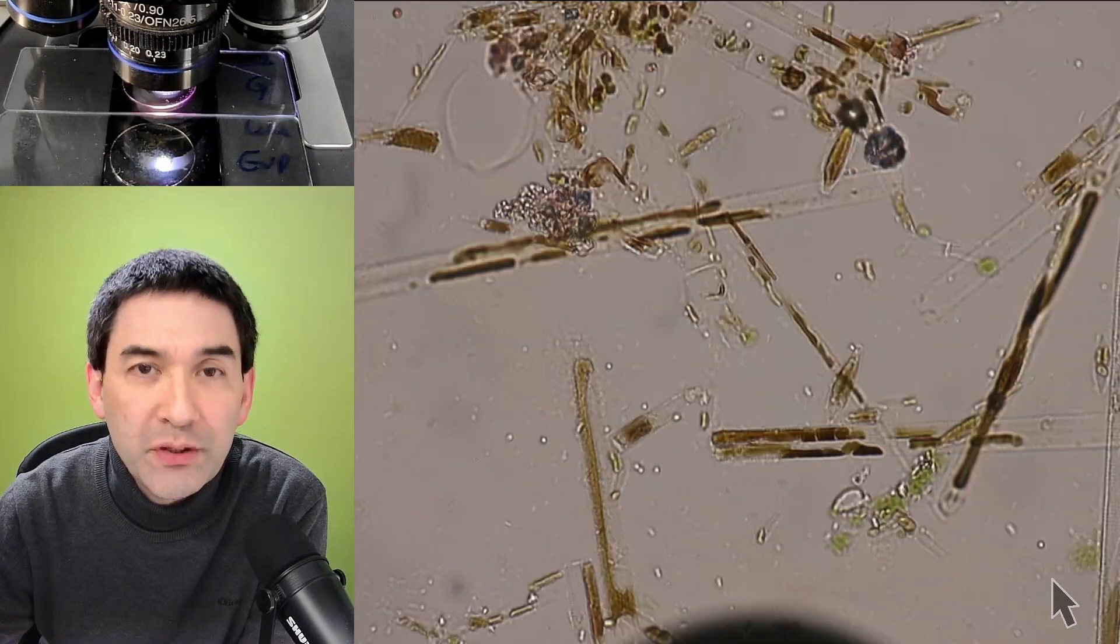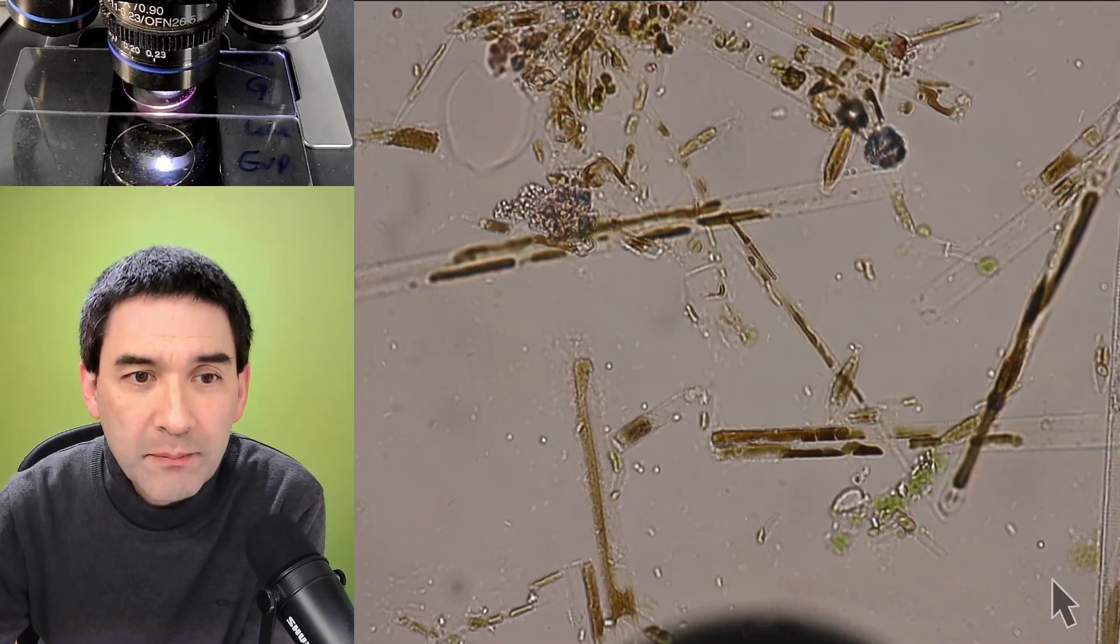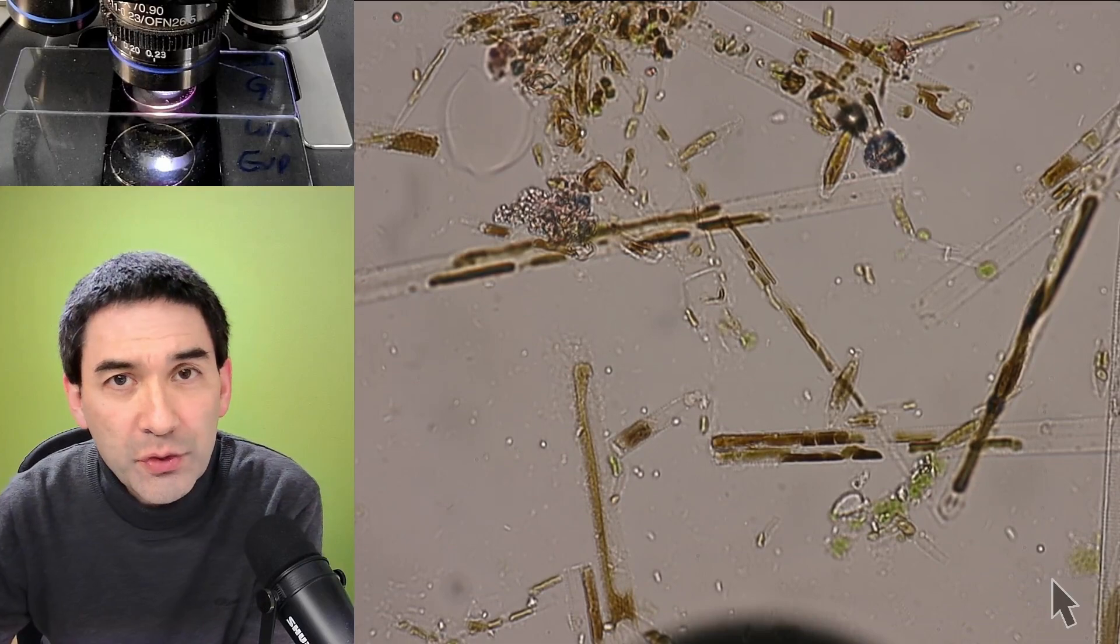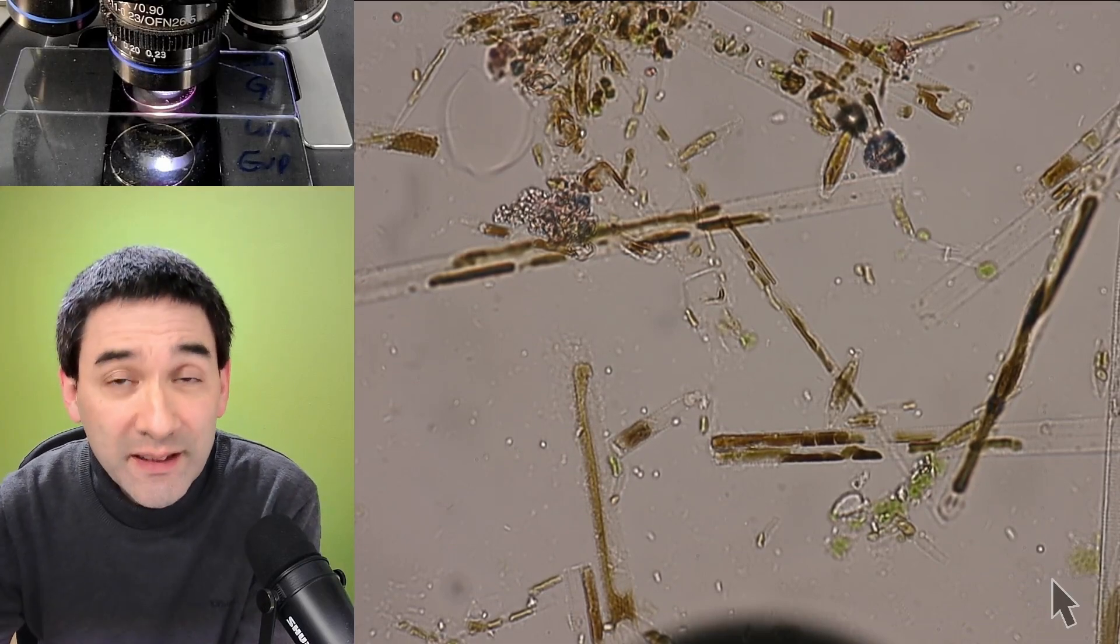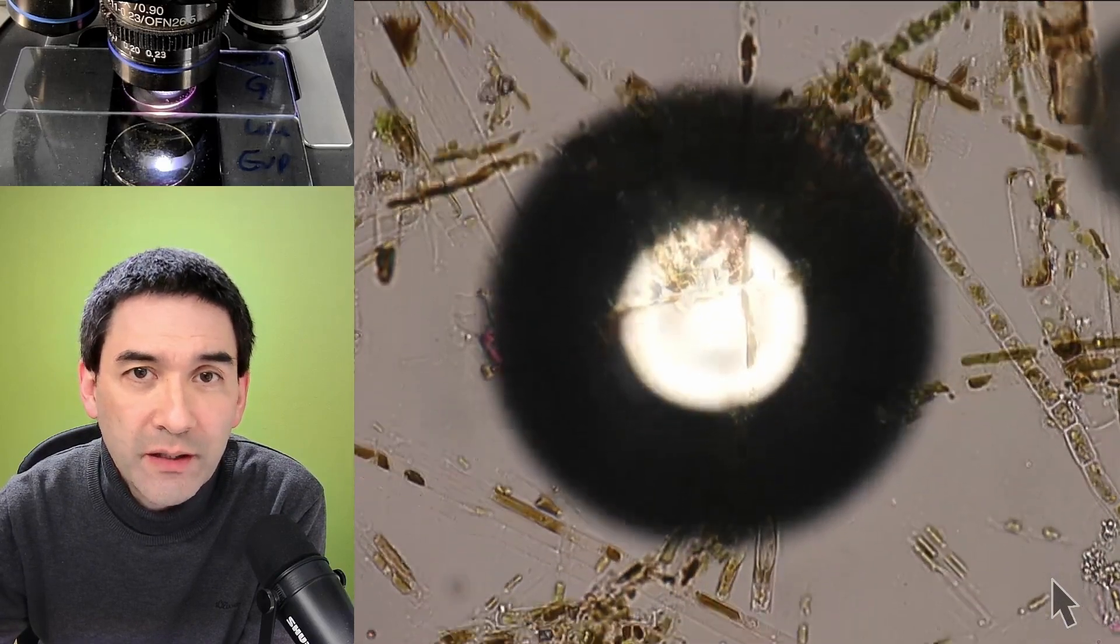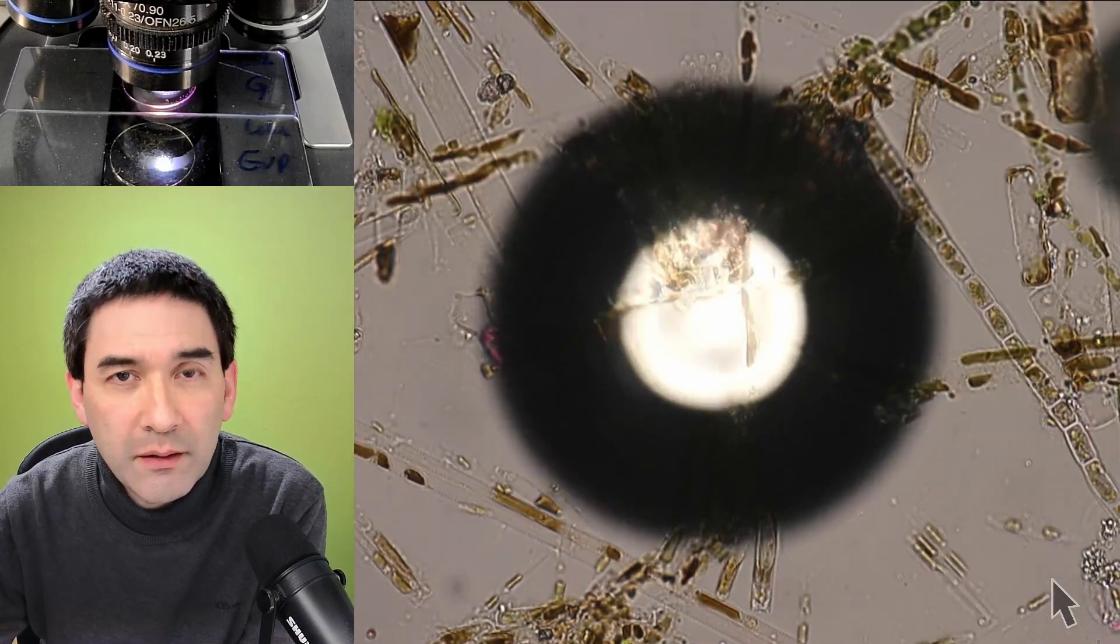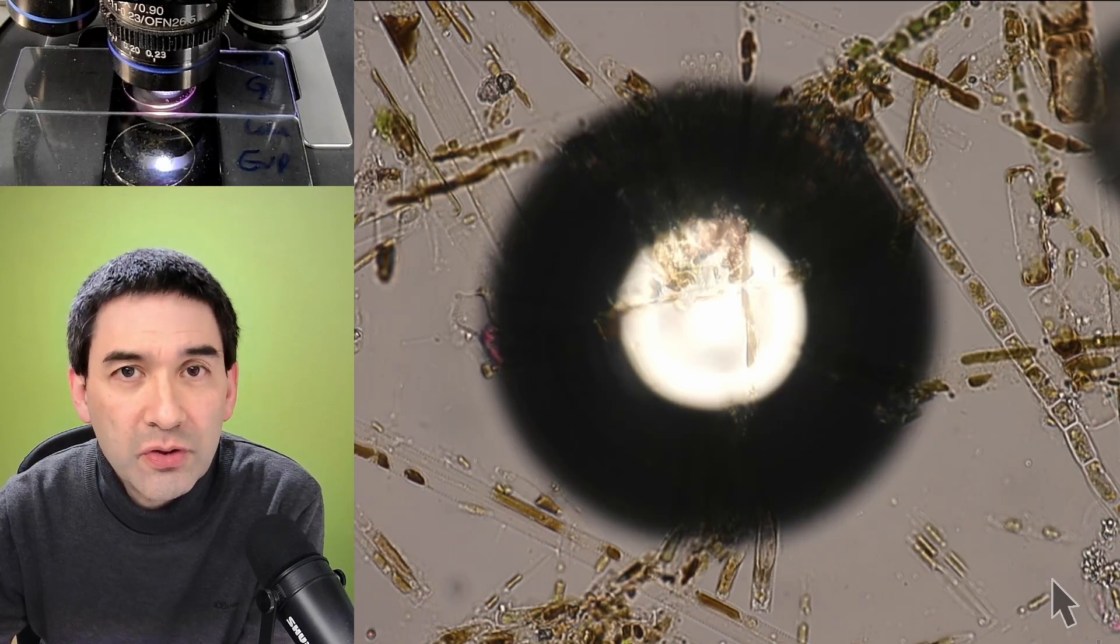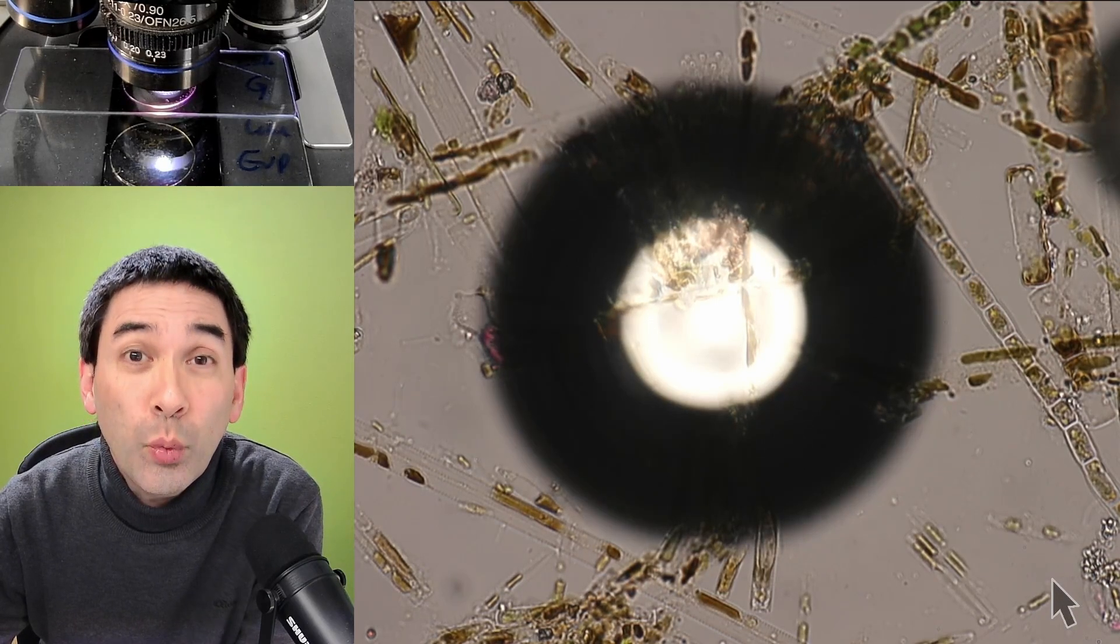Each of those mounting media also has its own advantages and disadvantages. One of the disadvantages of glycerin gelatin is what you see over here—the bubbles. It's difficult to use this mounting medium because you have to warm it up, so you have to melt the mounting medium, and then it becomes liquid. The bubbles start to appear, so you have to be kind of careful when making the permanent slide.